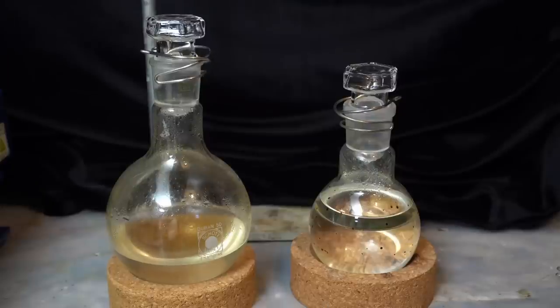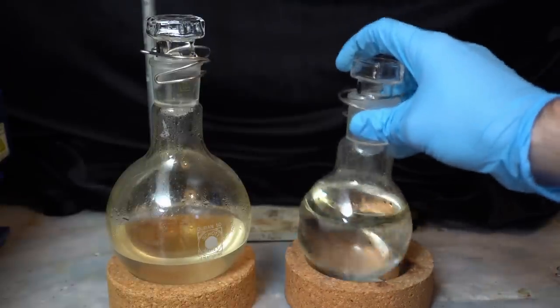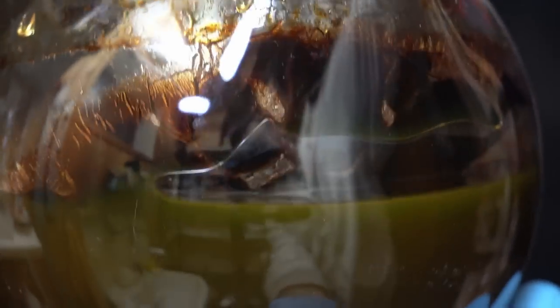After distilling about 400 milliliters I stopped the distillation. The yellow oil floating on the water is our product. In the distilling flask the crude has changed color into this vomit green and there's also some solid stuff in there. It looks really appetizing.